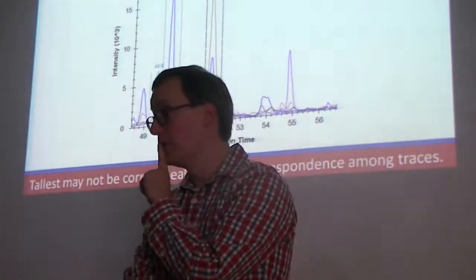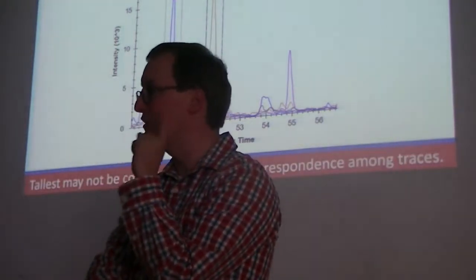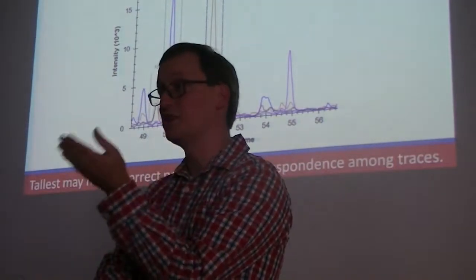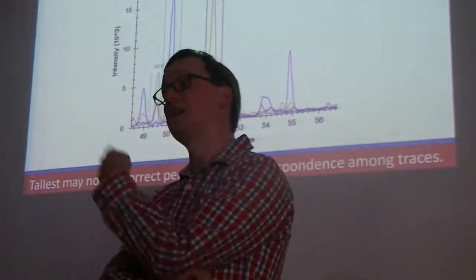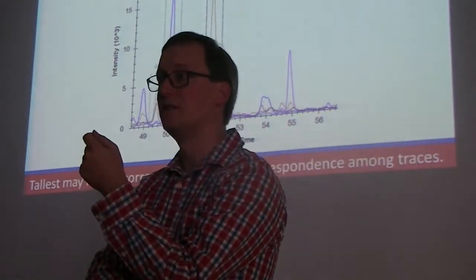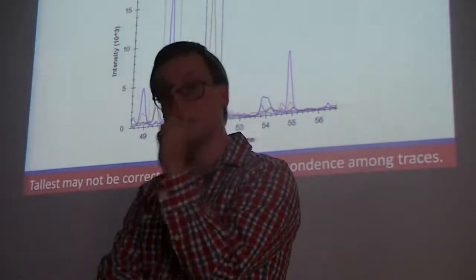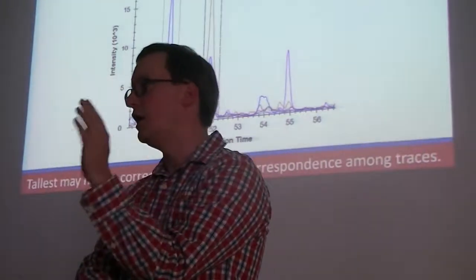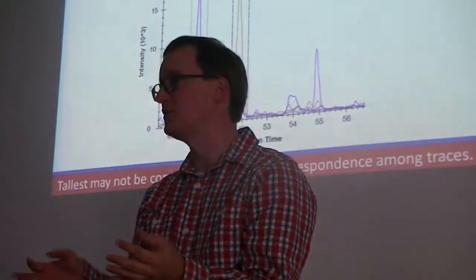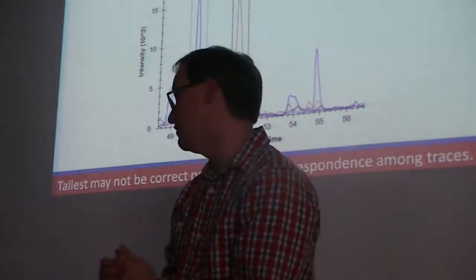Not yet. Clinical pharmacology at Tygerberg, however, does have 2 different triple quadrupole instruments. So that's great. And there's a mass spectrometry facility over on main campus that's got a pile of triple quads. So we have the availability of these instruments. If you have particular proteins and you want to know are they or are they not changing in these cohorts of experiments, you can do this experiment today through CAF, the Central Analytical Facilities.